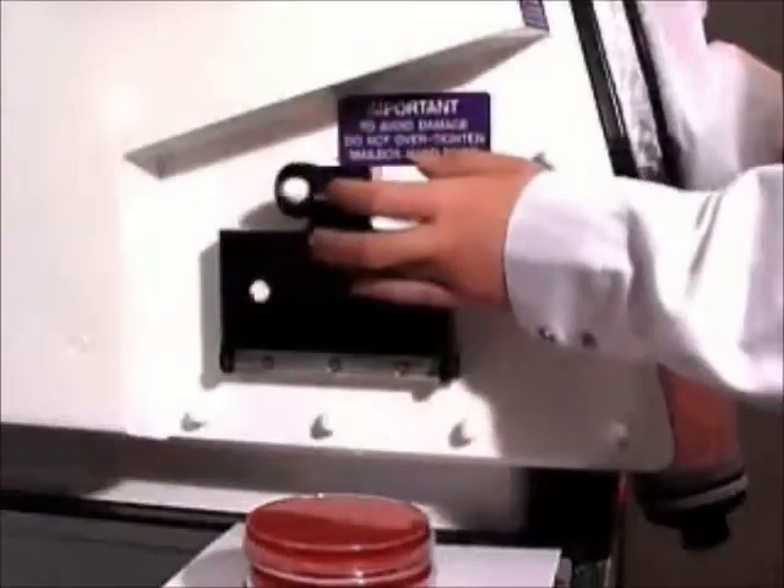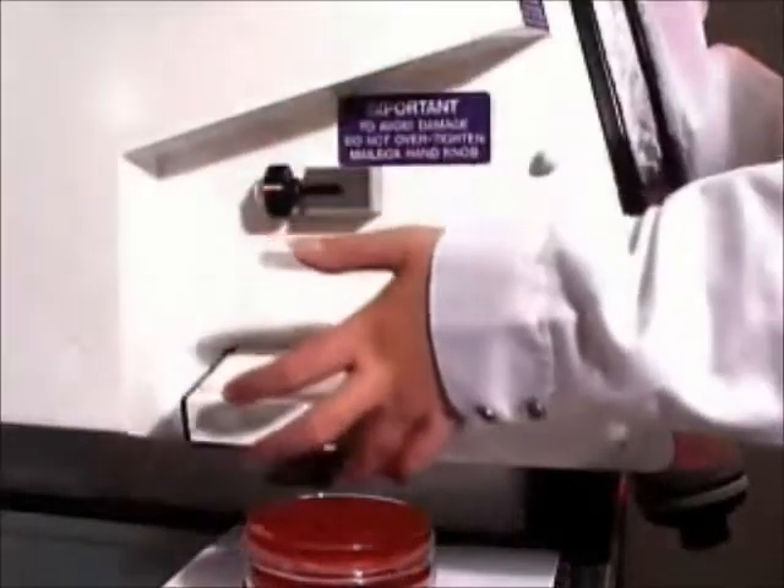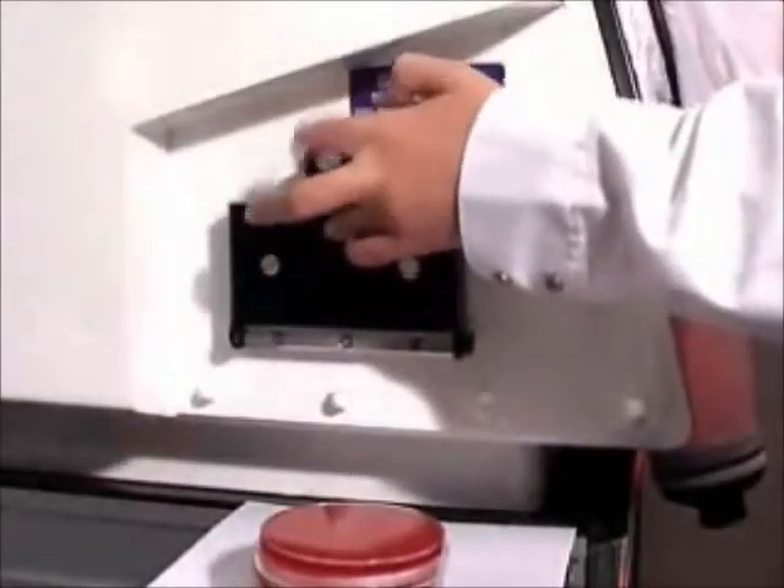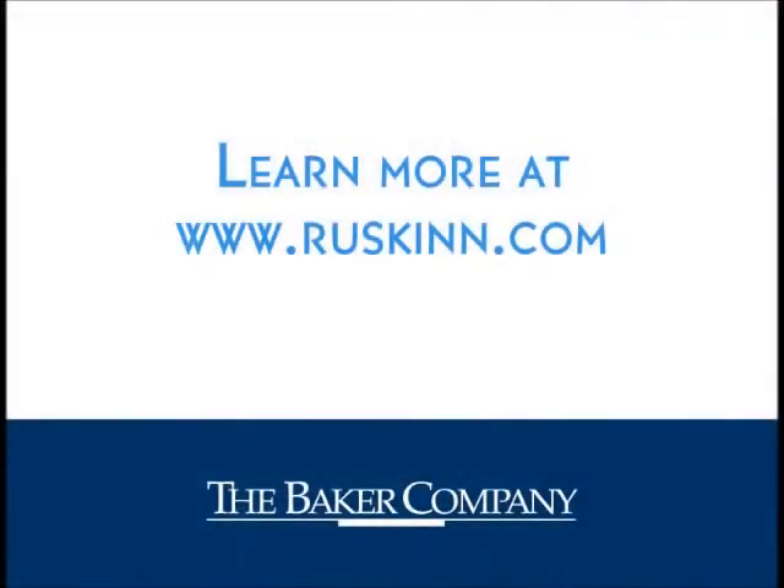The Ruskin Single Plate Entry System provides the facility to quickly and conveniently introduce samples as large as 15 cm dishes into the workstation without disrupting the preset oxygen level maintained inside the chamber.